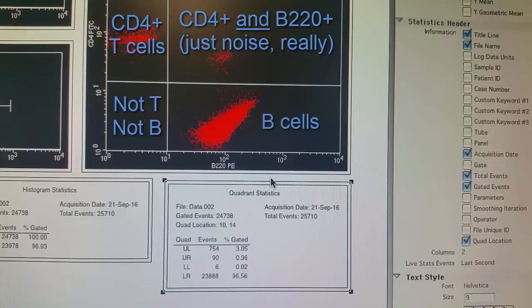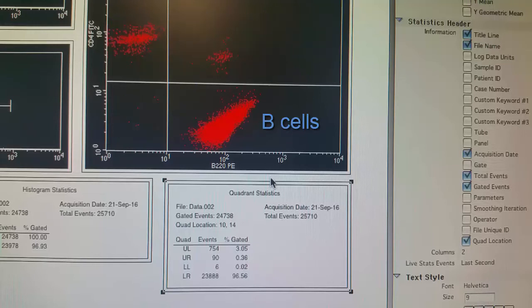Looking at this overall, we see that the great majority of cells — about 97% — are B cells. About 3% of the cells are T cells that express CD4. There are very few cells that are positive for both or negative for both in our sample.